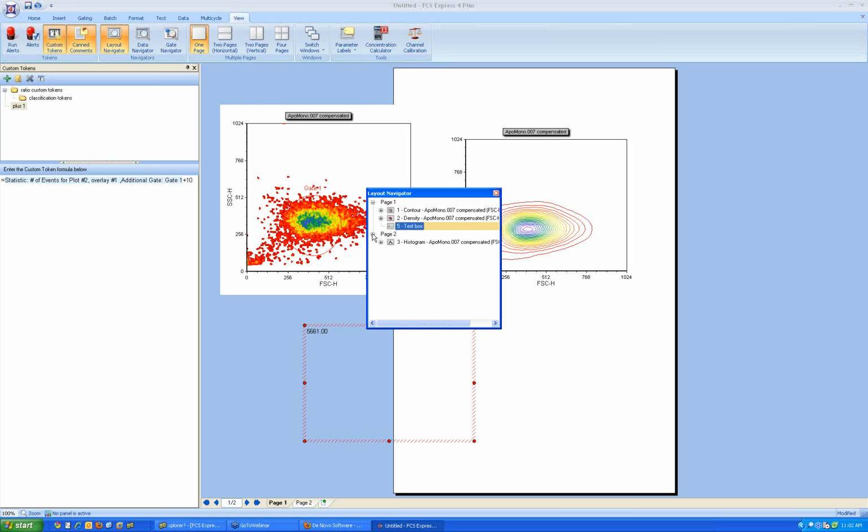That's about all for now. There are a lot more features, of course, that I haven't managed to get to, but we've already used up our hour. But I think I've touched on the major highlights.